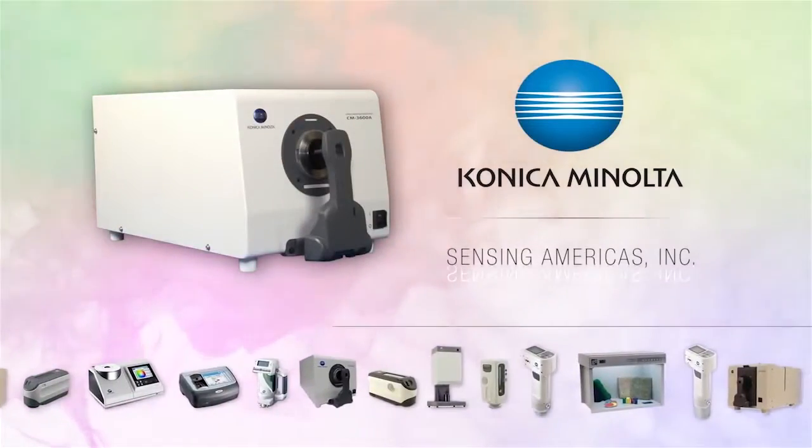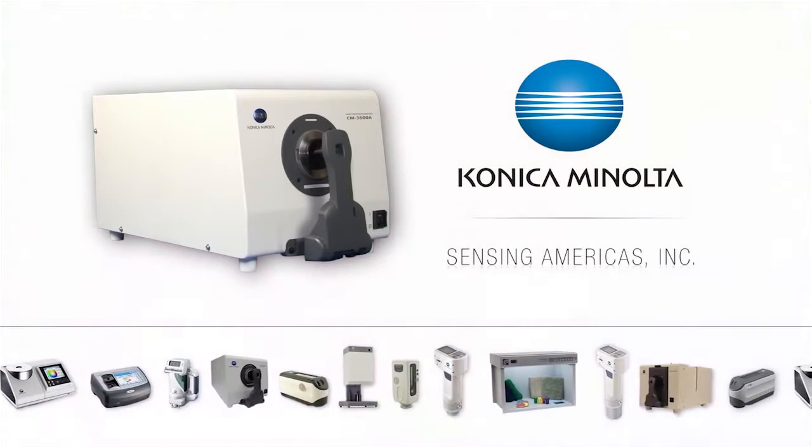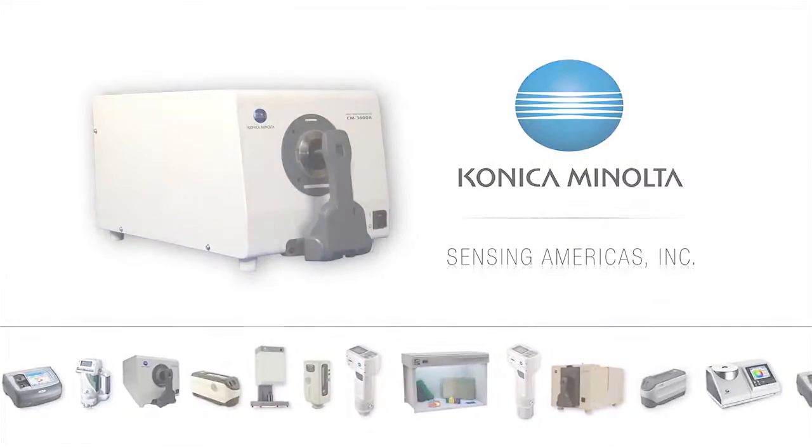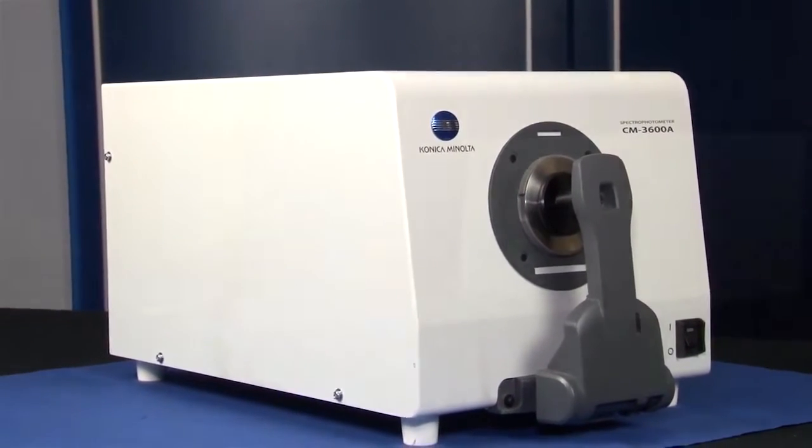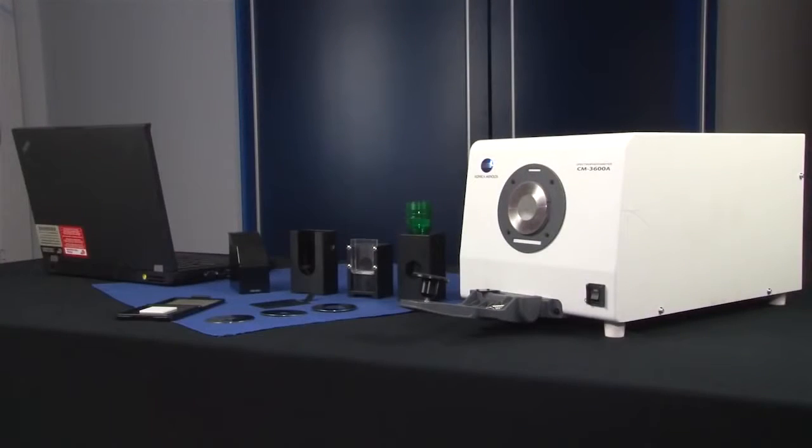Konica Minolta Sensing's CM3600A Spectrophotometer is a high-precision benchtop instrument designed to measure the color, UV, and relative gloss characteristics of opaque, transparent, and translucent materials.